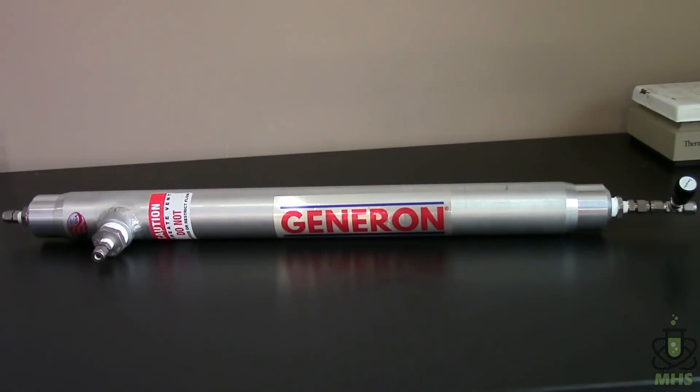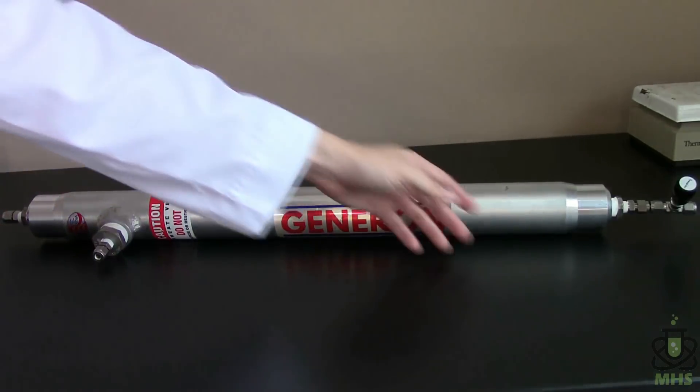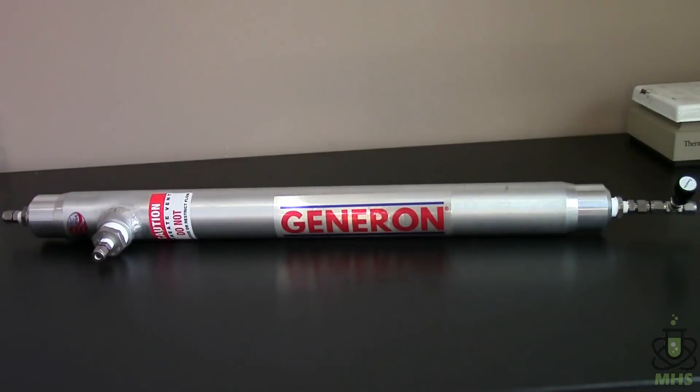Now what I have here is their model 210 module which I believe is the smallest they offer. These can get much larger for use in industrial setups but I got a small one just to test it out. The way it works is very simple. You pass compressed air into this end, the inlet, it then passes through the filter module and purified nitrogen exits out the other end. The oxygen that got filtered off then exits out through this side port here.